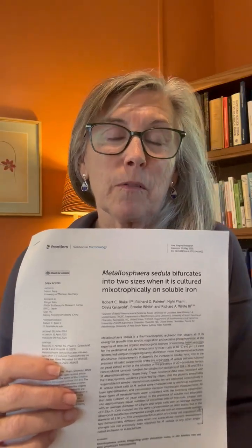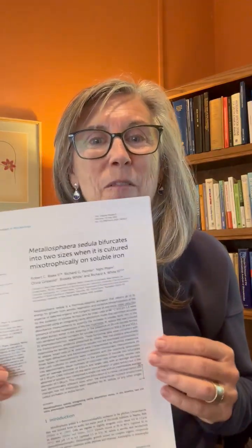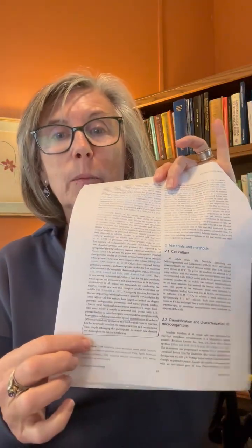15 years ago, Professor Robert Blake purchased the first of our Clarity UV-Vis spectrophotometers, devices for working with intact cells and other turbid media. And over the years, Bob has done some outstanding, very creative work with this instrument. And in this paper, what I'd like to just look at the moment is a sentence that he put at the bottom of his introduction, where he makes an admonishment to everyone interested in biochemical processes.